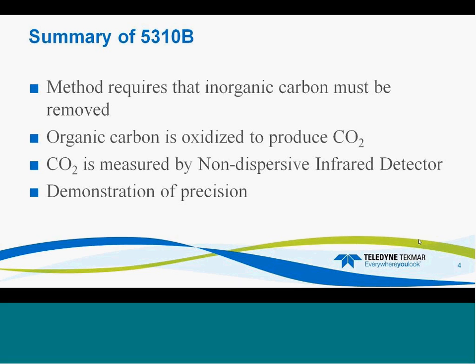As for 5310B, it's necessary that there's a demonstration of precision. More into that later in the presentation, but it basically means that you are analyzing samples the same way from one to the next.